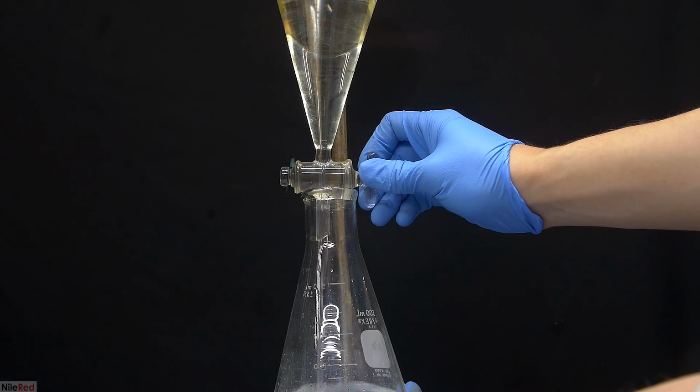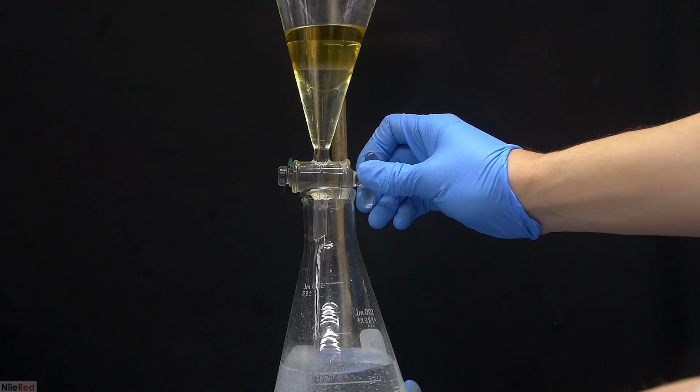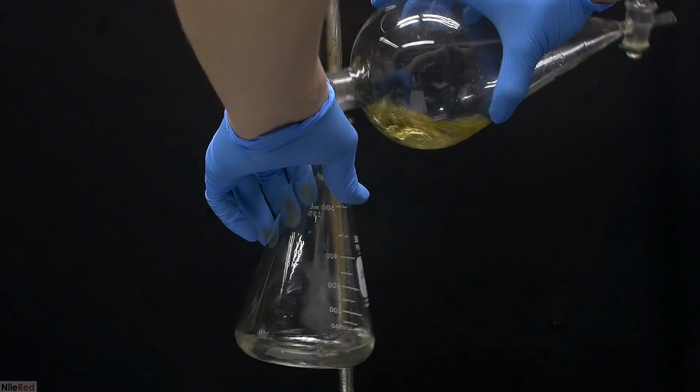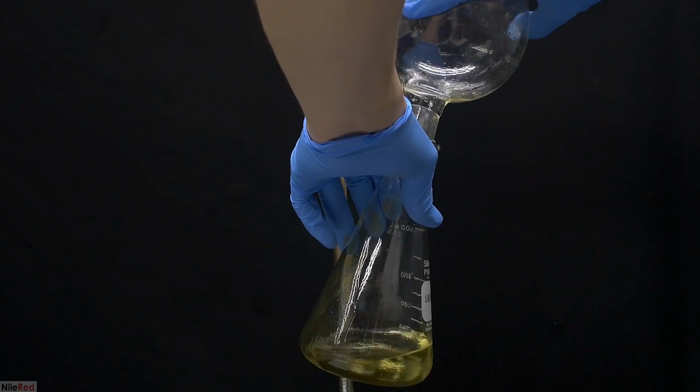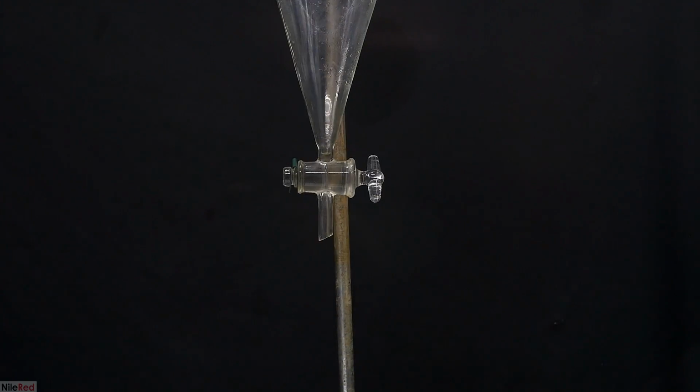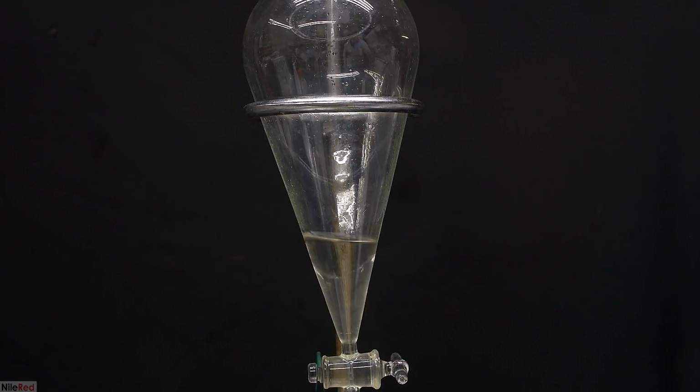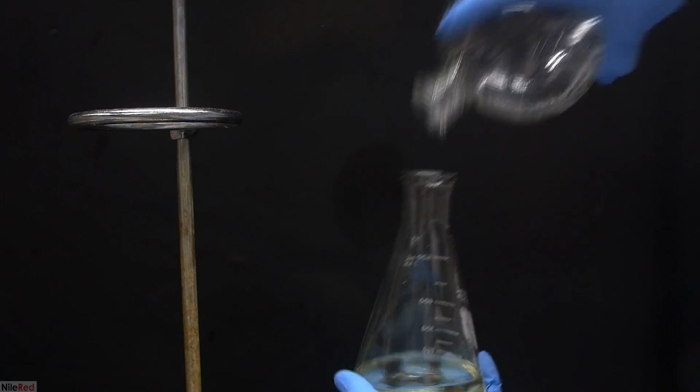Once the layers have separated, we again drain off our lower aqueous layer. The ether washing is then combined with our ether caproic acid mixture in the other flask. This washing step is carried out one more time using again 50 milliliters of diethyl ether.